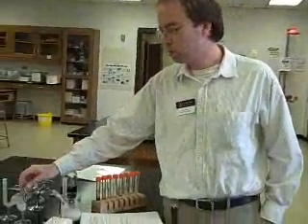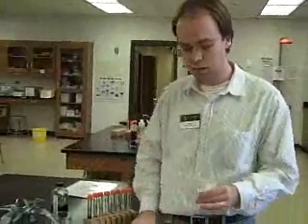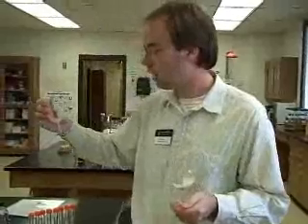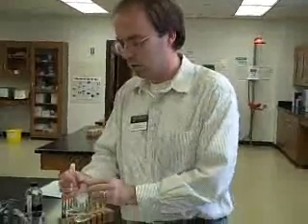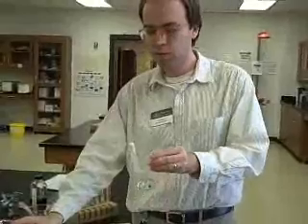Our second experiment was alcoholic fermentation with yeast. There are two kinds of fermentation I want you to know about: lactic acid fermentation and alcoholic fermentation. You should read about them both in your manual. But here's what our experiment was. These are fermentation flasks, and we had water in this one, we had glucose in this one, and we added yeast cells to each of them. Now, they're called fermentation flasks because they work well with fermentation.